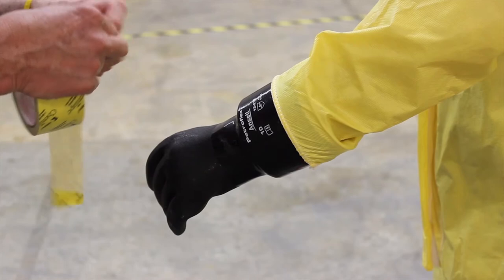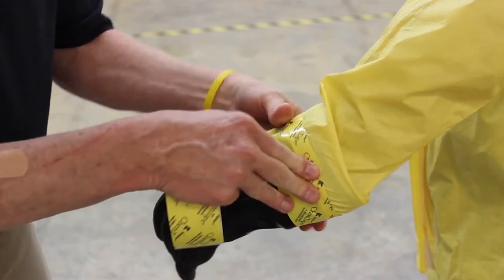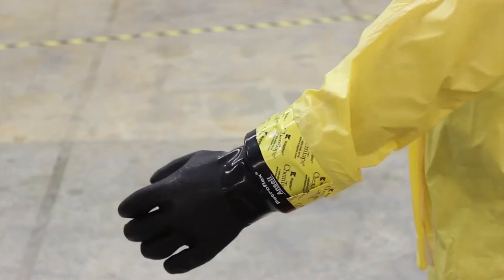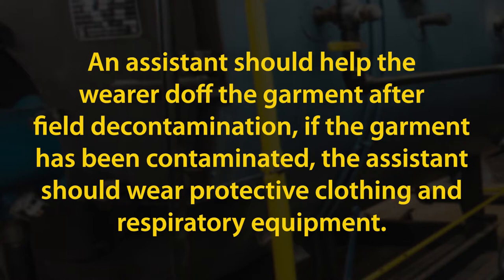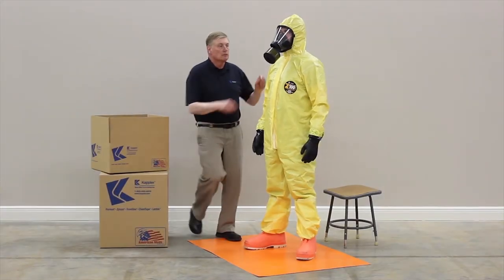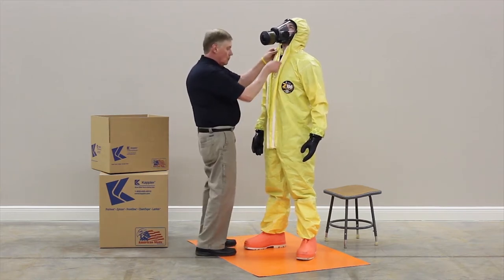Use Kepler chem tape in conjunction with the glove cone insert to maximize your liquid splash protection. Secure the garment storm flap and slide the zipper closure down.